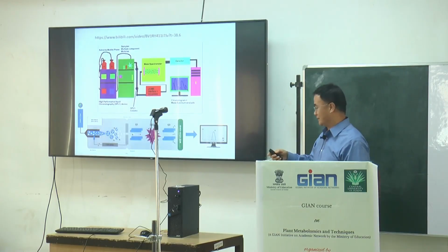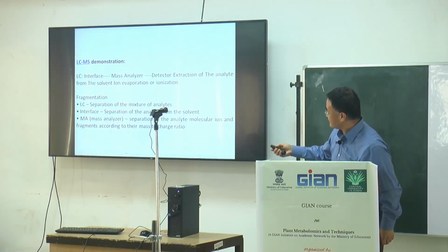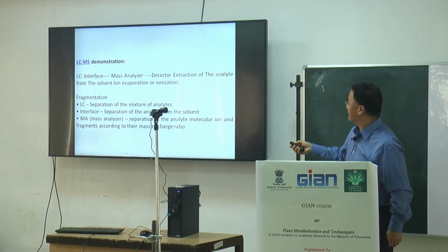Then you can continue. This is the core part. Yesterday we talked about the interface, the different ionization ways, and mass analysis.